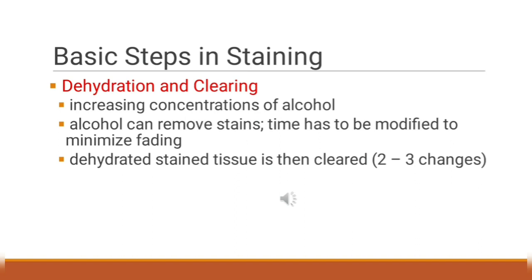Mounting is done after second or third xylene. So there are 2 reasons for clearing. First is that most mounting media, especially resinous media, are immiscible in alcohol but miscible in xylene. The second one is to raise the refractive index of the prepared slide.